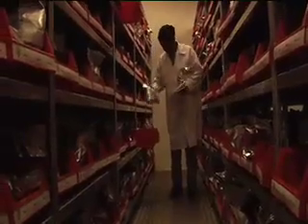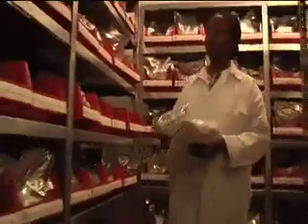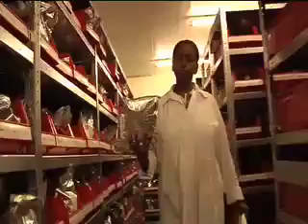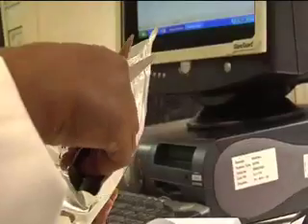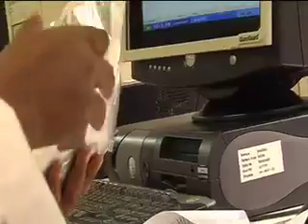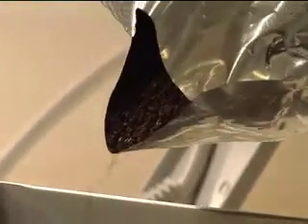The packages of seeds are identified and brought to the preparation room to take seed samples from each of them. The packets are first allowed to warm up to room temperature before they are opened, to avoid any condensation forming on the seeds. Usually, only a small number of seeds from each accession is provided for distribution, because the amounts of seeds stored in the gene bank are limited and very valuable.